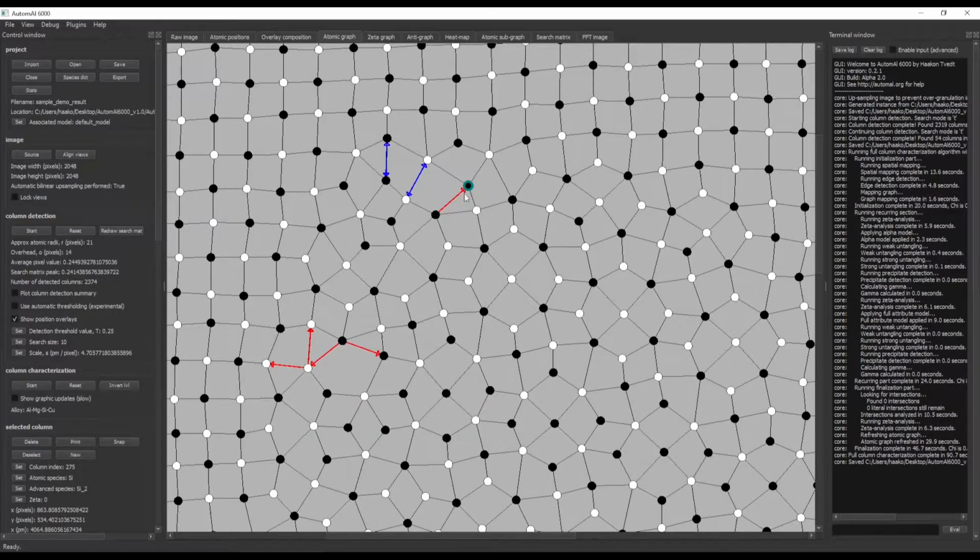And by that I mean that you see here you have the different colors, white and black. That is the two different set heights. And by opposite plane nearest neighbor, I mean that these two are nearest neighbors, but they are on opposite planes. This one and this one is also nearest neighbors.